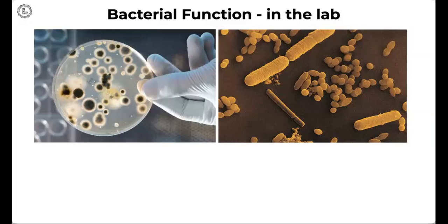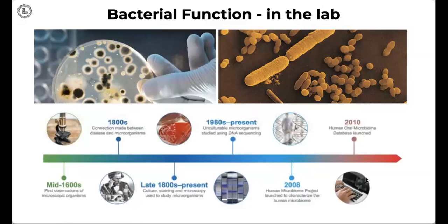And this is where sequencing methods actually began to shift the whole field as the development in sequencing methods increased, right? So when we reached the next generation sequencing methods or high throughput sequencing methods, soon this became a way to study not individual microbes or individual microorganisms, but actually the whole community of these microorganisms in different types of environment.